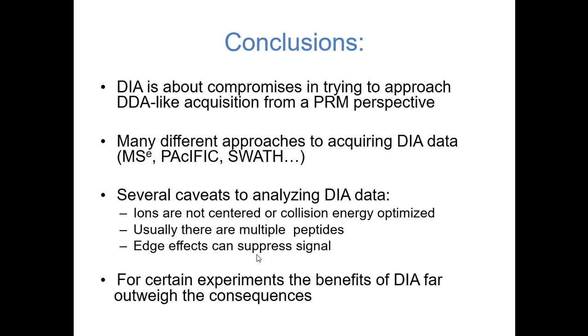I mean, which I don't know where it's eluting. Those prediction programs are garbage, like SSRCalc and that sort of thing. It's enabled in Skyline, but they're really not worth using as a starting point for DIA analysis. They're pretty dangerous in that regard, unless you've got something special cooked up by yourself. I would be pretty nervous about using something like SSRCalc to pick where peptides should elute, because that will be that peptide range, but plus or minus 10, 20 minutes.